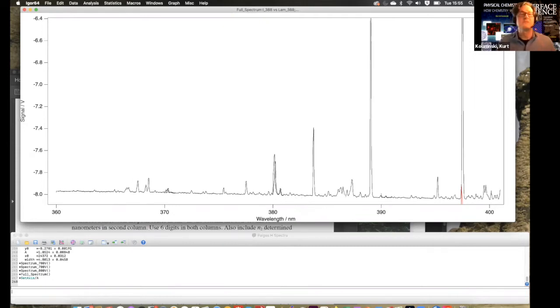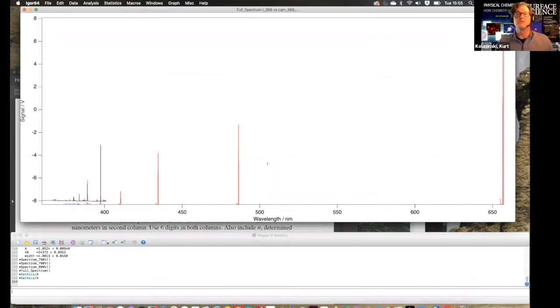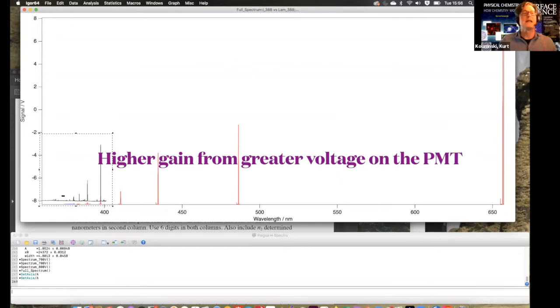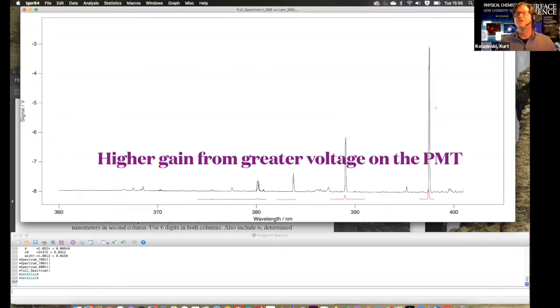We don't just have H atoms, but we have other things, or they might be other series. So we're using the intensity and the wavelength pattern to tell which is the next peak we want, right? At first, it's pretty clear: the red, the green, we get some blue and a violet peak. That intensity pattern's really clear. And then we get out here and we go, okay, we can continue that at higher gain, and we know which ones we want. Okay, boom, boom, boom.